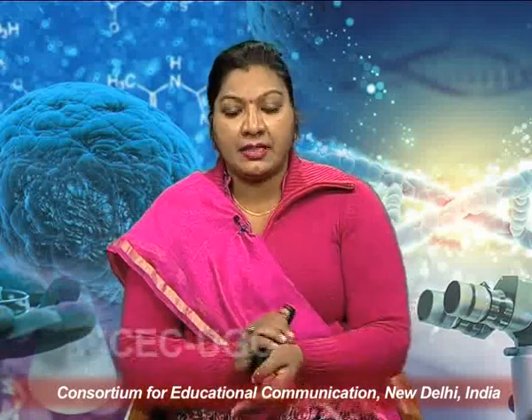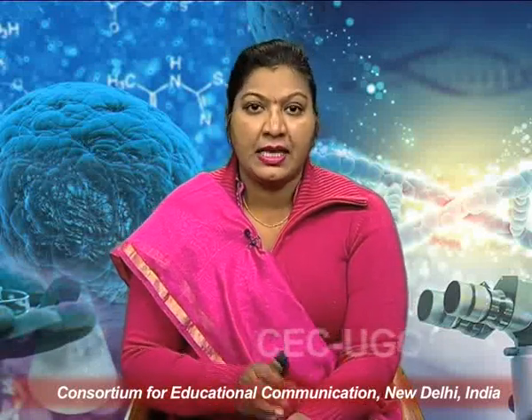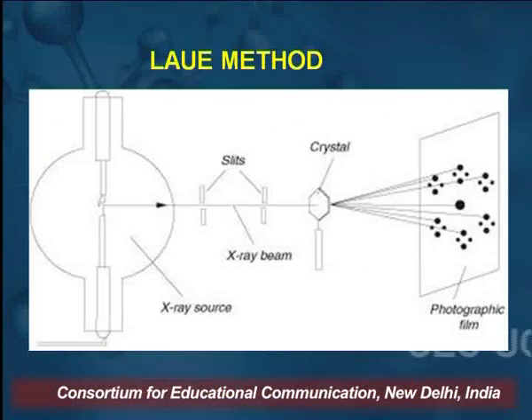Now, the next method, which is a very important method, as we discussed, there are various methods of X-ray diffraction. So the first method we discuss is the Laue method. As we see on the screen, there are various components of this Laue method. On the left hand side we have the X-ray tube.